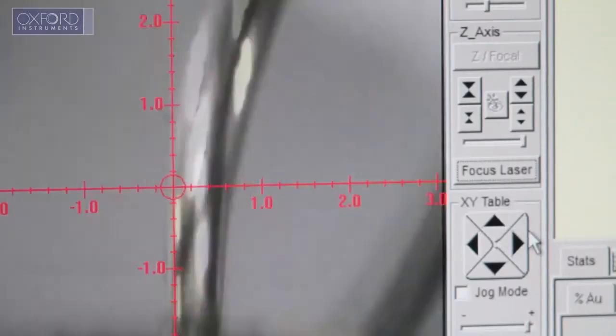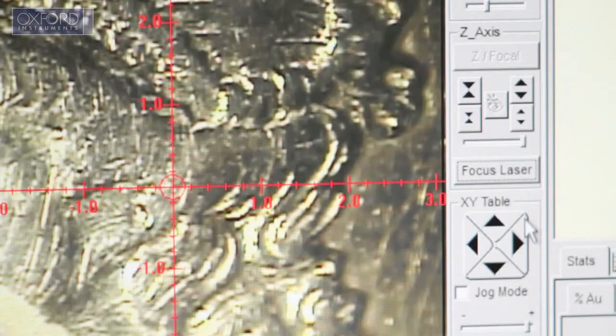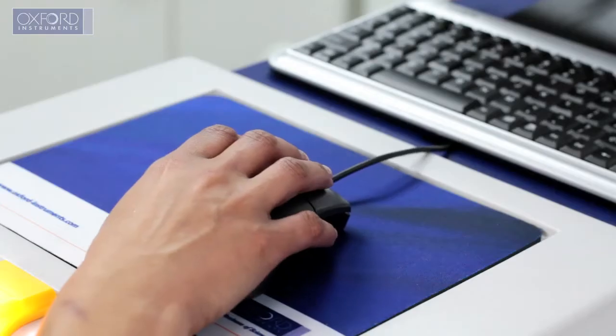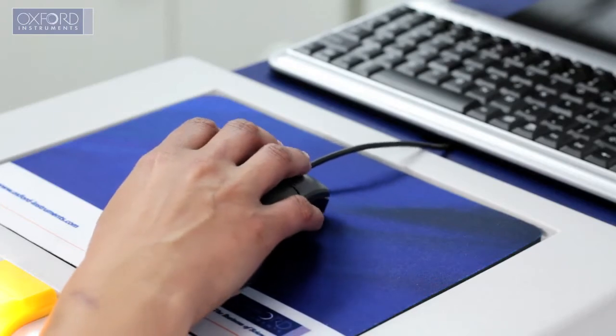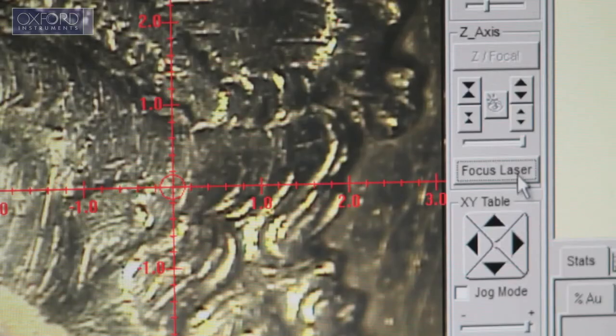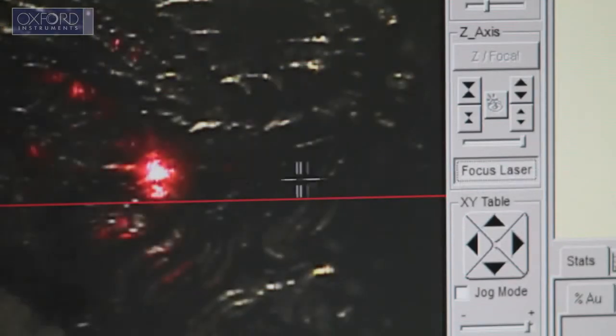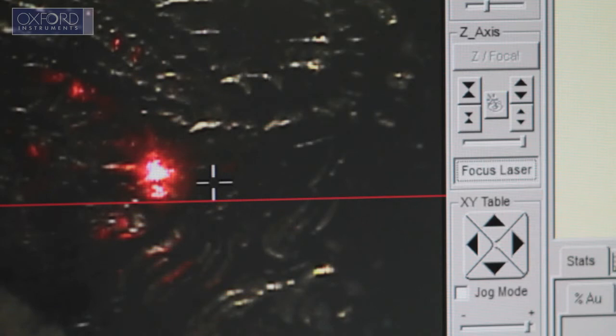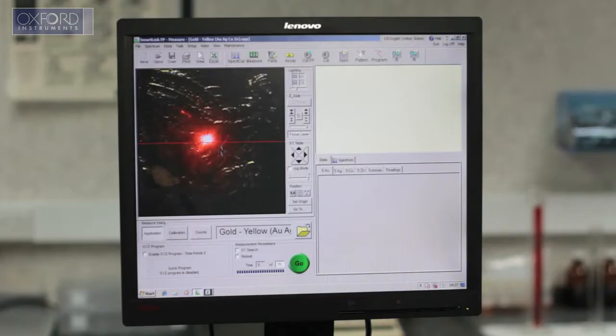The instrument camera gives a clear image of the sample. Next, bring the image into focus using the point-and-click focus laser. This ensures results repeatability and accuracy irrespective of the user.